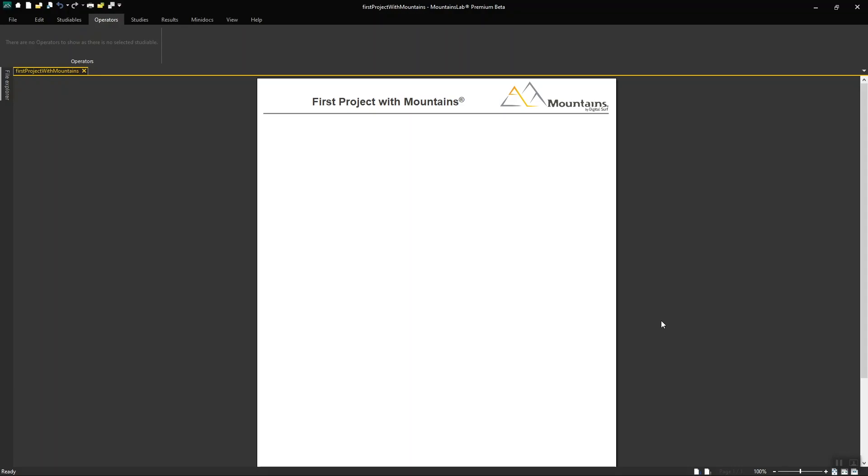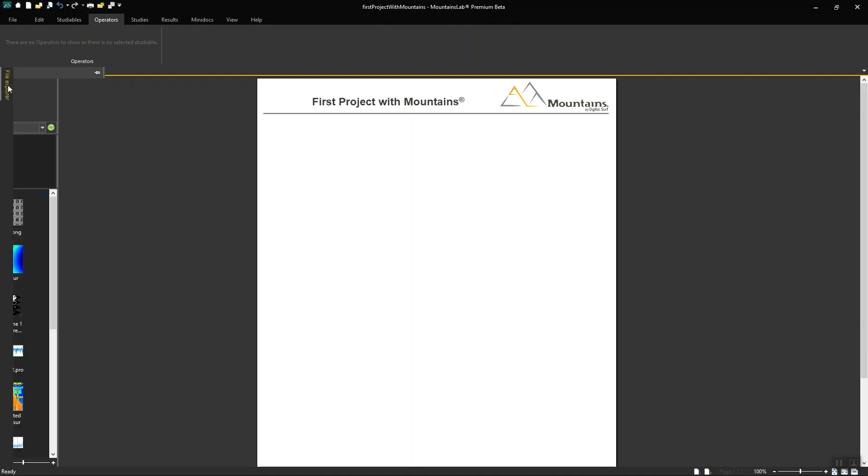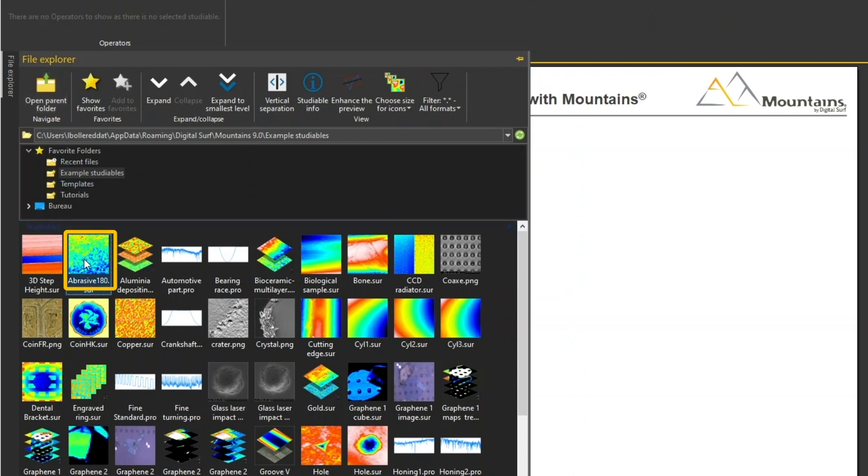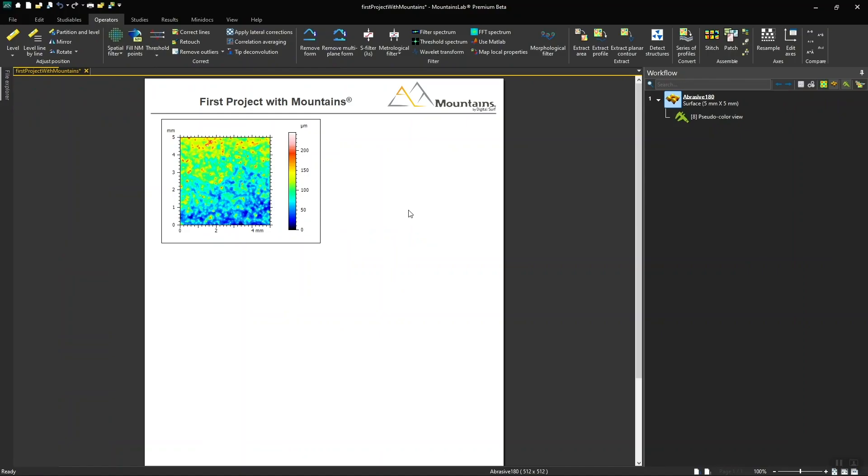First of all, let's load a studyable. Say I want to quantify the roughness of an abrasive paper surface. I open the abrasive 180 example studyable available in MOUNTAINS. The studyable appears on the document and in the workflow.